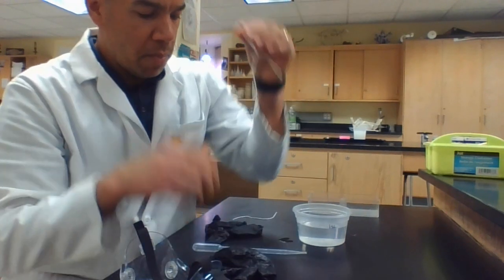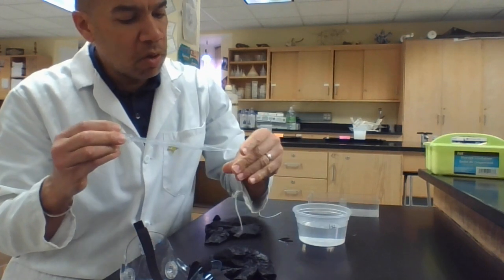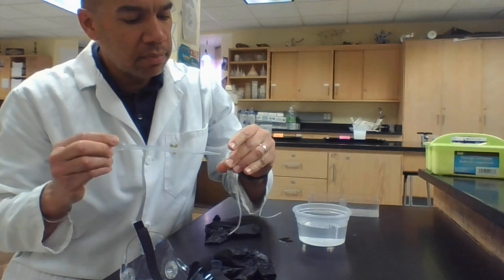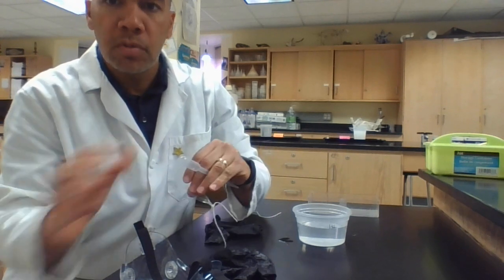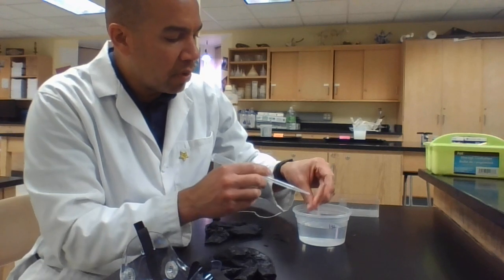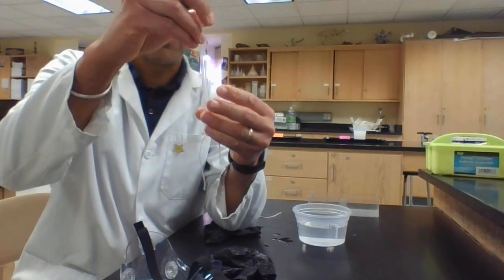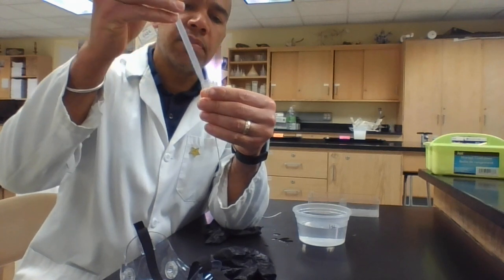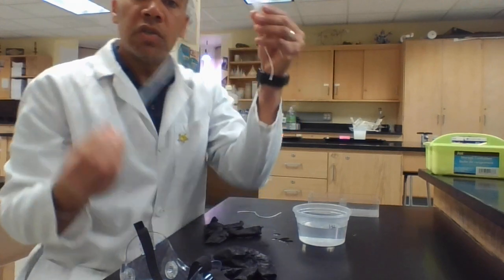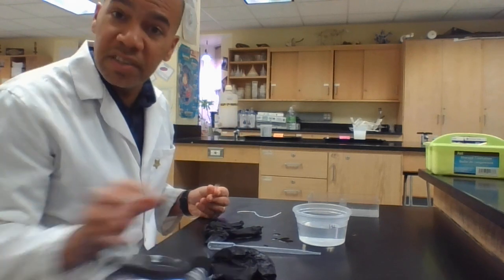Okay, so now I go back to making sure I have this side open. It started closing up on me already. Sorry, I'm going to pause. So what I did to help me get it back open again, you just dip it into the water and then it's able to open again. Okay, so now that we have this open, we're going to go back over to what's right behind me where we have starch and glucose. See you there in a second.